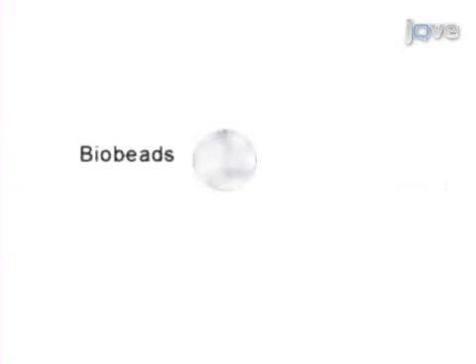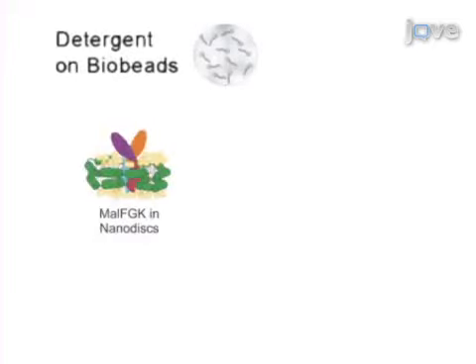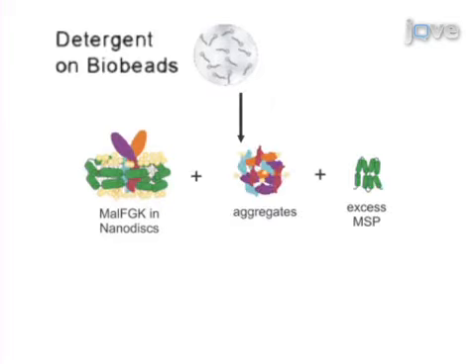The second step is to add polystyrene beads and to gently rock the mixture overnight. The detergent is progressively adsorbed onto the beads, allowing the formation of the nanodisc particles. Next, the beads are removed by sedimentation.